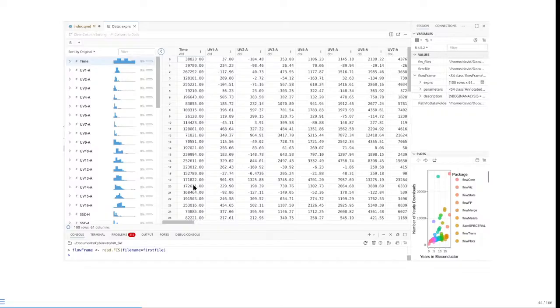And one of the nice features within Positron is that it gives you a little summary table on the side, which can help you get a general idea of how the particular data is distributed. Is it really large values, is it really small values, do you have anything missing? This is one of the nice things about Positron as far as what it's able to show you.